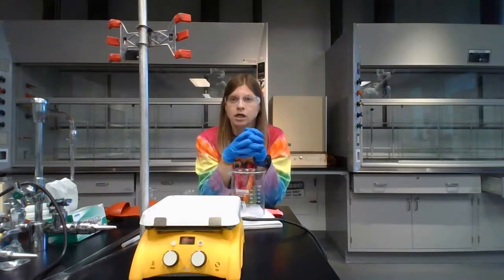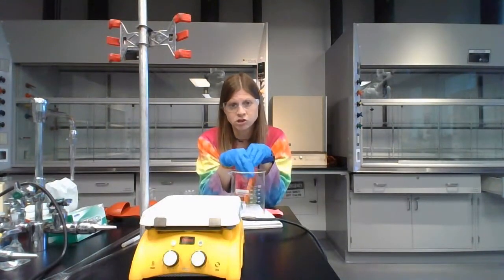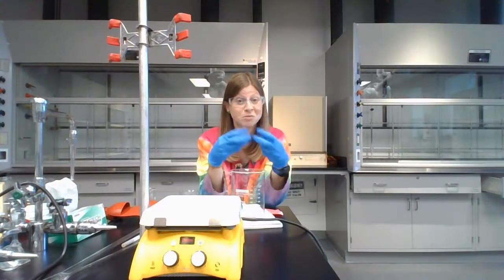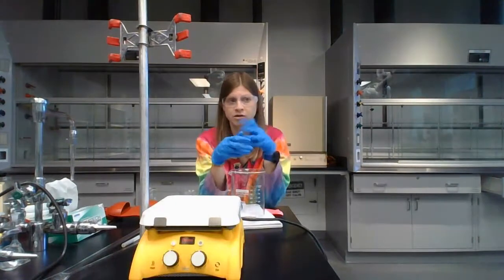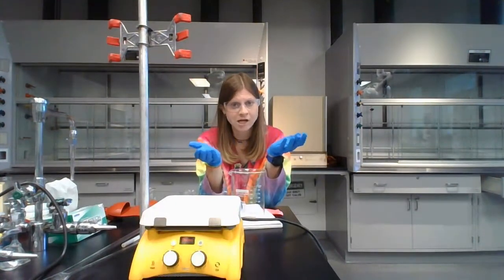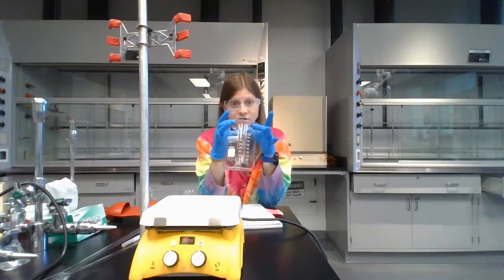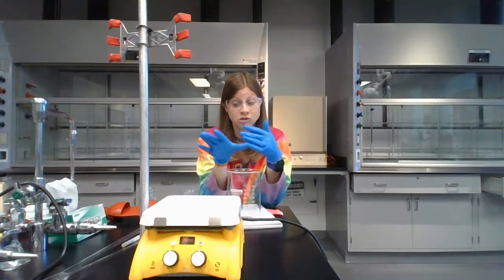Now, when the pool neutralizer mixes with our mixture, it makes a carbon dioxide gas. It makes CO2, so it makes bubbles. So you're going to have to pour it in small amounts at a time until the bubbles stop forming, and then check your pH. It should be 6, 7, 8, or 9. Once you've reached that, this solution can be dumped down the drain, and then the beakers can be washed, and everything can be washed and put away.